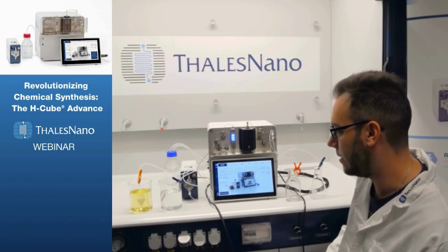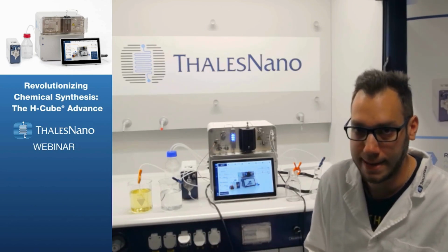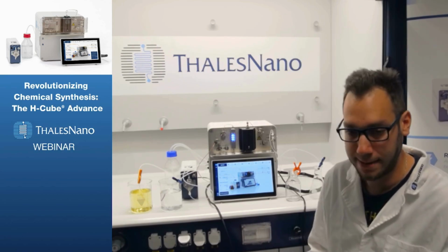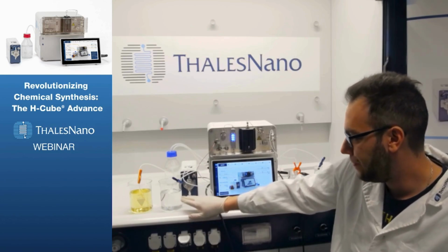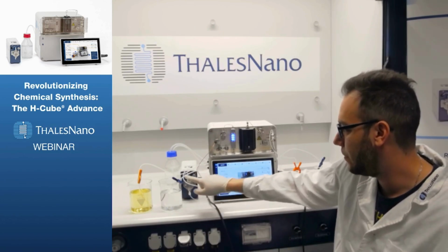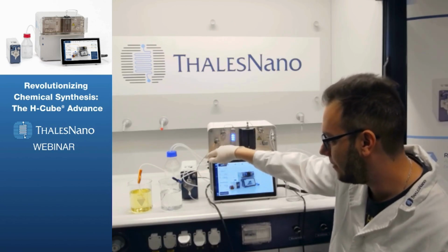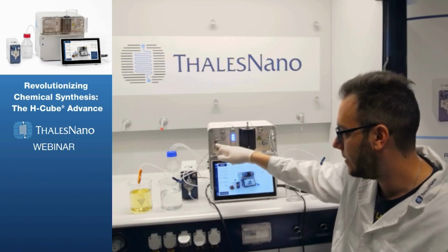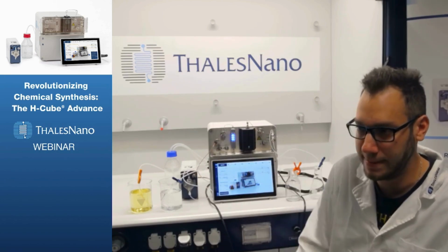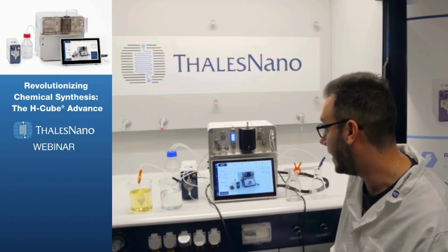Today we are going to start with the solvent to do a pre-washing and an activation of the catalyst cartridge inside. So we are going to select this side, and then the HPLC pump will carry the liquid through this tube into the selector valve, and it goes into the pump head, which is then injected through this tube to the first step inside the H-Cube Advance, which is actually a gas liquid mixer.